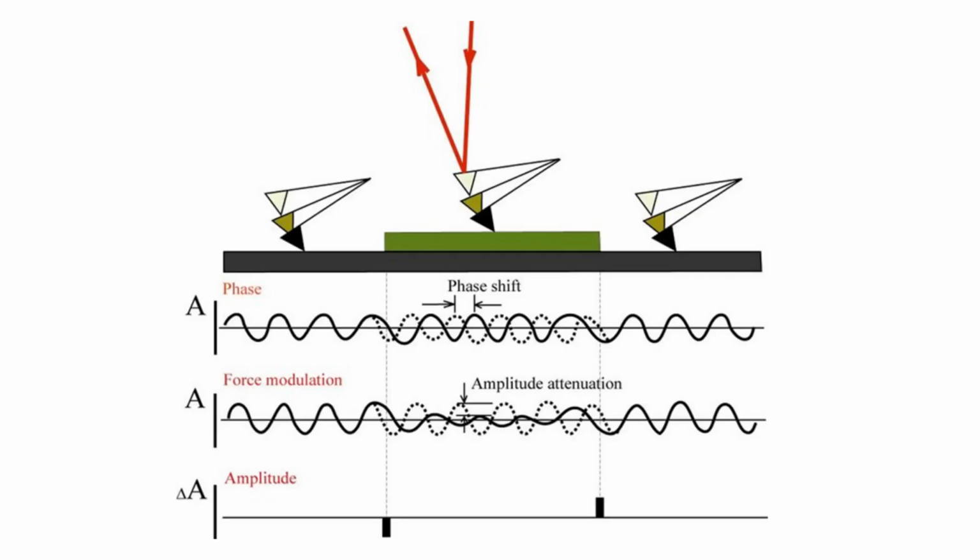So in this diagram, it shows how the phase and amplitude detection of the AFM work. When the topography changes, it will introduce a phase lag, and the amplitude will show a pulse, whether down or up. The phase will always show the phase lagging. So the middle one is for detecting how hard the surface is, because the amplitude change in the middle getting smaller means it is a soft surface in the middle.